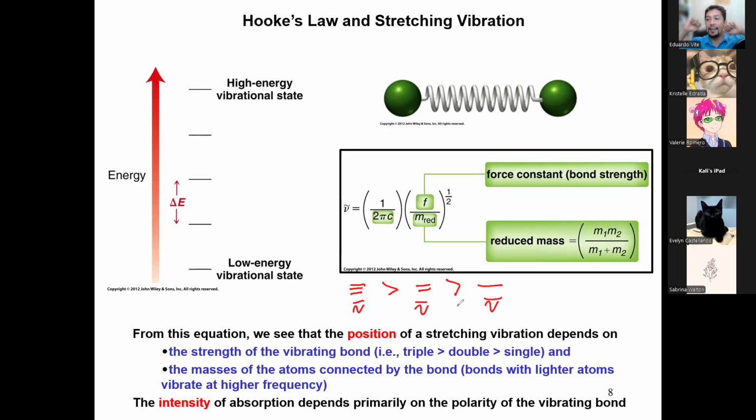And not just that. Again, imagine you have carbon-carbon. Well, they're both the same weight. They're going to vibrate pretty symmetrically, pretty normally, right? Nothing much is really going to happen there. There's no difference. Imagine oxygen and hydrogen, like in a hydroxyl group, in an alcohol group, right? Oxygen's molar mass is 16. Hydrogen's molar mass is 1. You have a big object next to a small object connected by a bond. Well, it's like a paddle ball, right? The hydrogen's going to behave like a paddle ball, and the oxygen is the paddle. You're only going to have vibration from the hydrogen, and it's going to be very strong because you have energy with a small amount of mass, right?